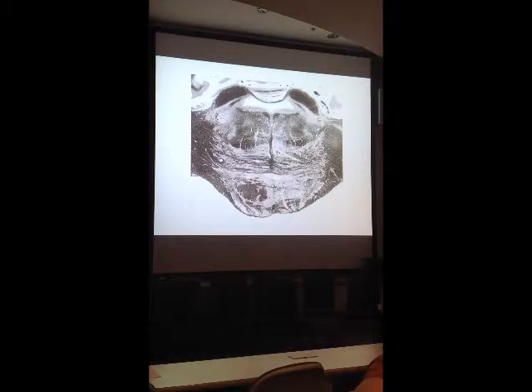And then medial to that, more recently in the third part of the course, when we reviewed cranial nerves, we talked about the trigeminal motor nucleus. So these are lower motor neurons of the trigeminal nerve located here. And they send their axons out to innervate the muscles of mastication, or other muscles. So on this slide, there are two major cranial nerve nuclei that you should be able to identify: the chief sensory nucleus of the fifth nerve, and the trigeminal motor nucleus.